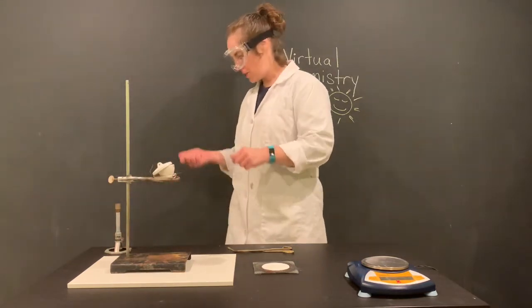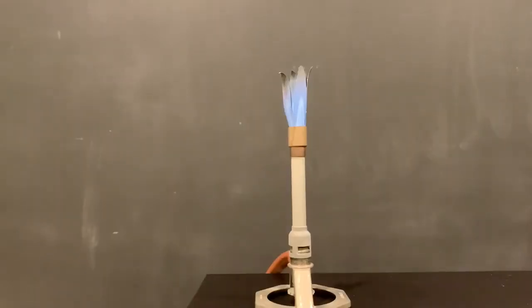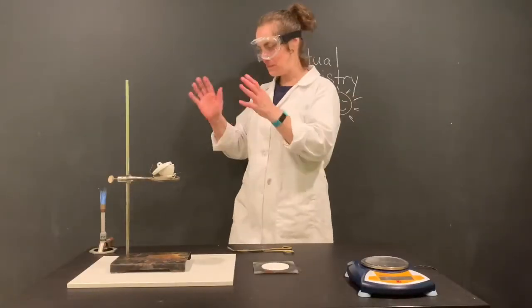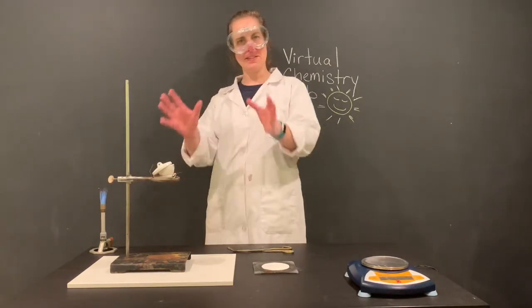And then I'm going to hook it up to the gas, and I'm going to light the flame. So now that we have a nice beautiful flame, we're going to take that flame and we're going to move it underneath our experiment so it can get started.